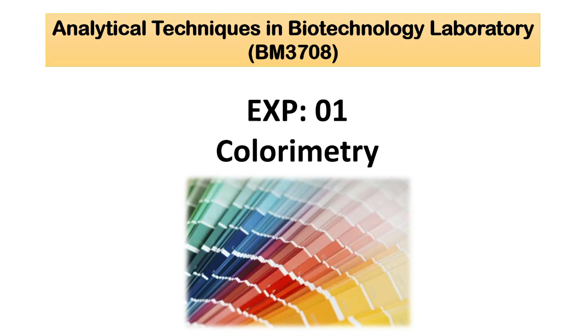Here we will look into the quantitative parameter of color and how we can use it. If time permits, we can use some AI algorithms in one of the future classes with this colorimetric device, and look into how you can integrate artificial intelligence into the analytical techniques domain.